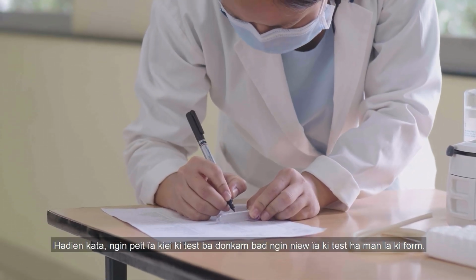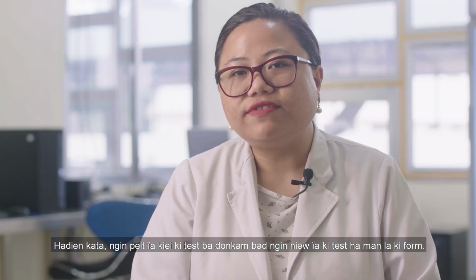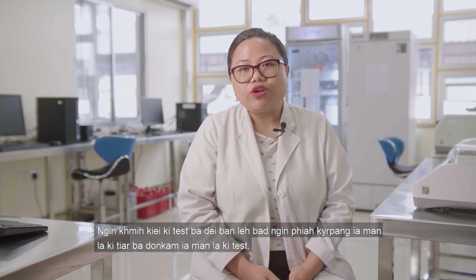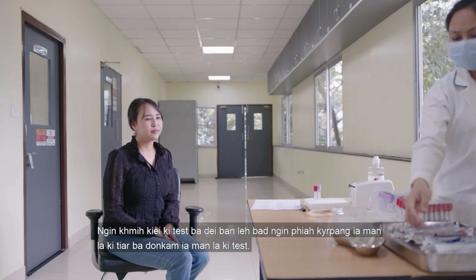Next, we'll look at the test that's going to be required and we're going to count the number of tests present for each requisition form. We're going to map out what tests are required, and we are going to separate the different types of consumables that will be required for each test.